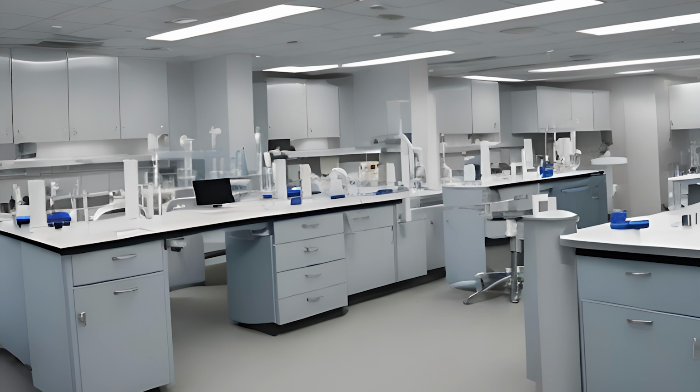A chemical fume hood is a necessity for every clinical chemistry lab. The fume hood is your only safe location to open a container that's giving off harmful vapors, to prepare reagents that produce fumes, and to heat flammable solvents. Closing the window on that hood can contain a potential fire that comes from those solvents.